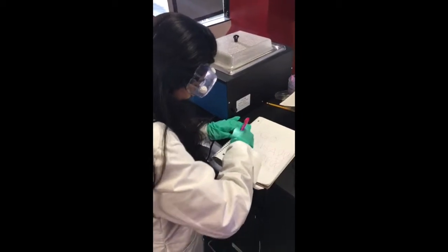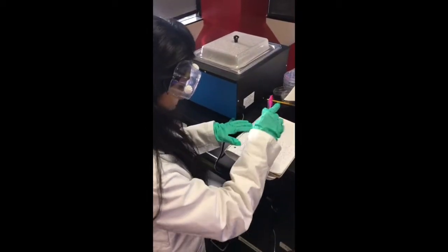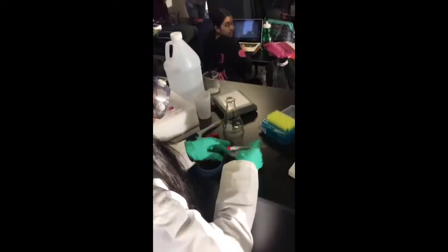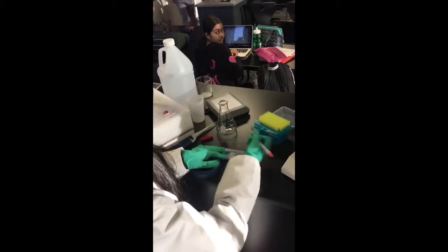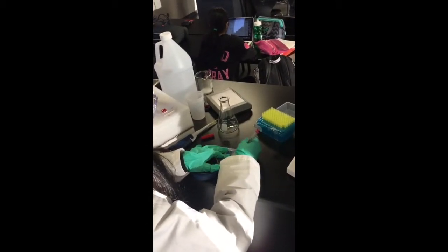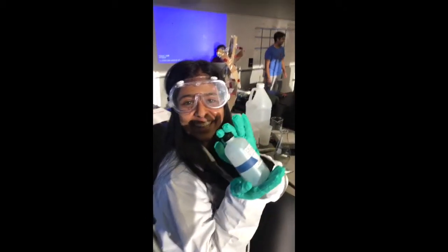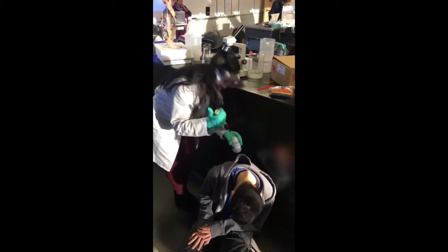But I need to test for the presence of these antibodies in the serum, so I have to utilize ELISA. First, I have to label the microtiter plate, which has many wells. Some will be control wells and some will be experimental wells. I have carefully extracted the vanilla disease antigen solution from my dear brother, who is affected from the disease.